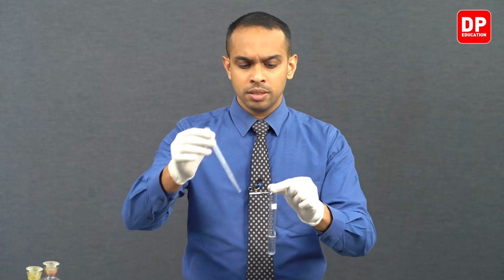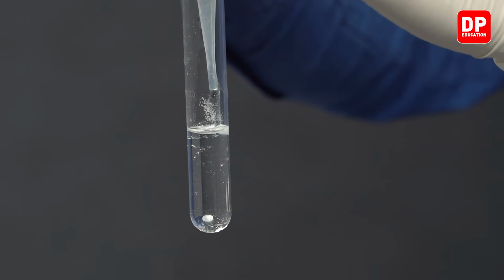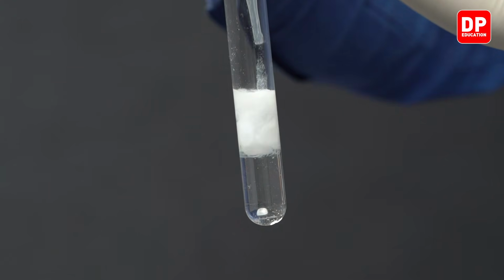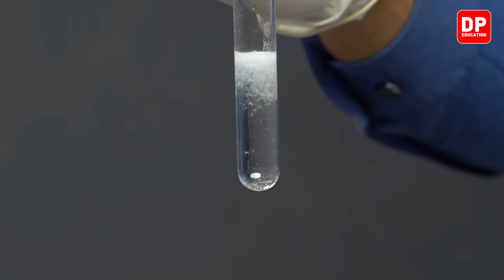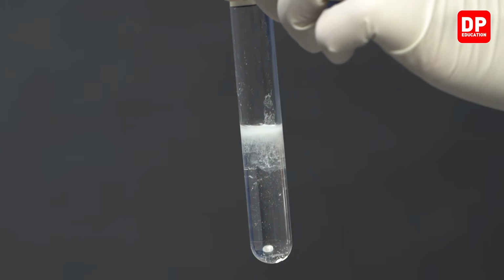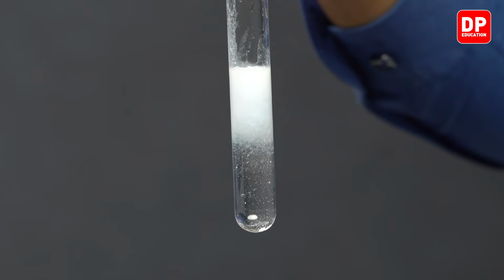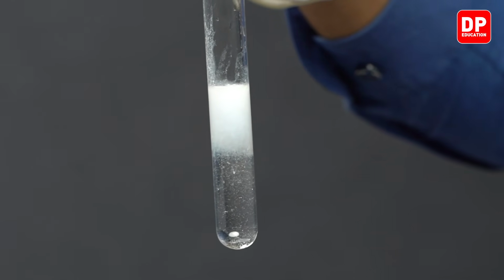So let's add our lead acetate into our thiosulfate solution. As you can see, when we add lead acetate to our thiosulfate solution, we can very clearly observe the formation of a white precipitate. We can add a little bit more lead acetate. You can see when lead acetate comes into contact with the thiosulfate solution, we form lead thiosulfate, which is a white color precipitate.